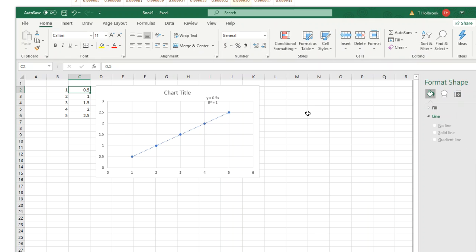So in a lab, maybe what you would get here would be something like maybe 0.4893 or 4, and maybe 0.9987, and maybe 1.5019 or 18, and maybe 2.0991, and maybe 2.345 or 85. There we go. So you would actually get a bigger equation here that has a y-intercept on it now. But the slope is still the number that's assigned to the x. And that slope in this case is 0.4819, which means that my density is 0.4819 based on the graph.